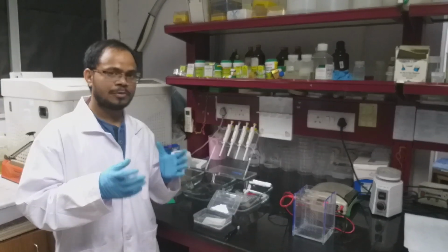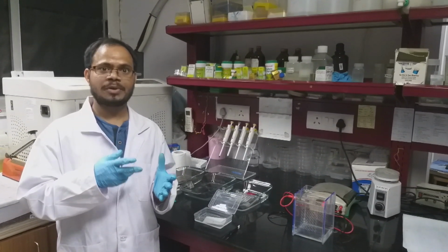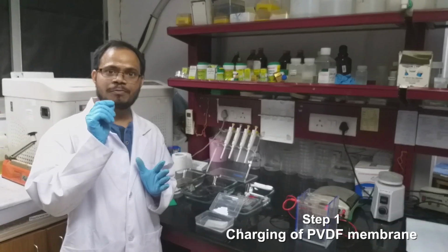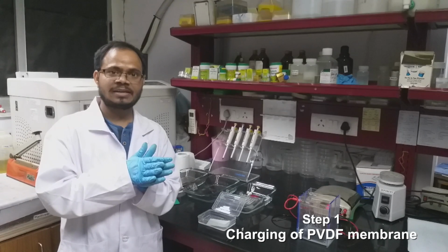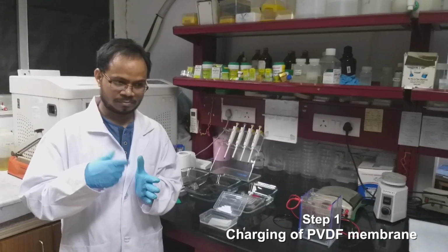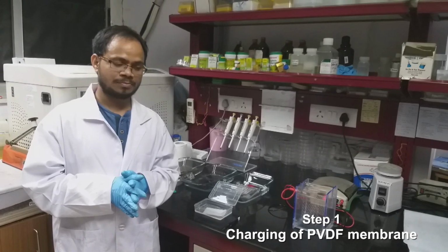If you are taking from a bundle, you have to cut precisely how many wells you want. After that, you have to label the front of the blot, where that front side is used for transferring the protein, and also in further steps like antibody incubation.